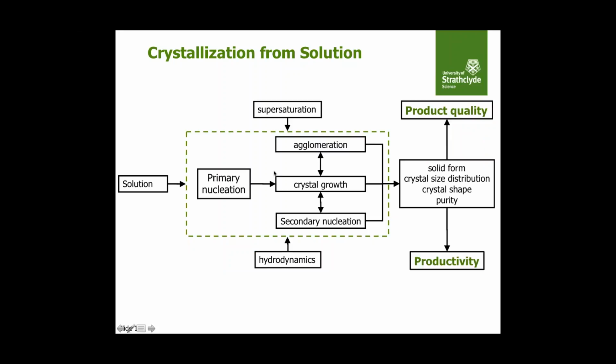The crystallization process consists of a number of sub-processes. There is primary nucleation, the formation of crystals, and these crystals then grow out to become macroscopically large. If these crystals are large enough, they might hit the stirrer, so that you create attrition fragments, and that process is called secondary nucleation. Sometimes you see that these crystals agglomerate together to form particles that consist of several single crystals.